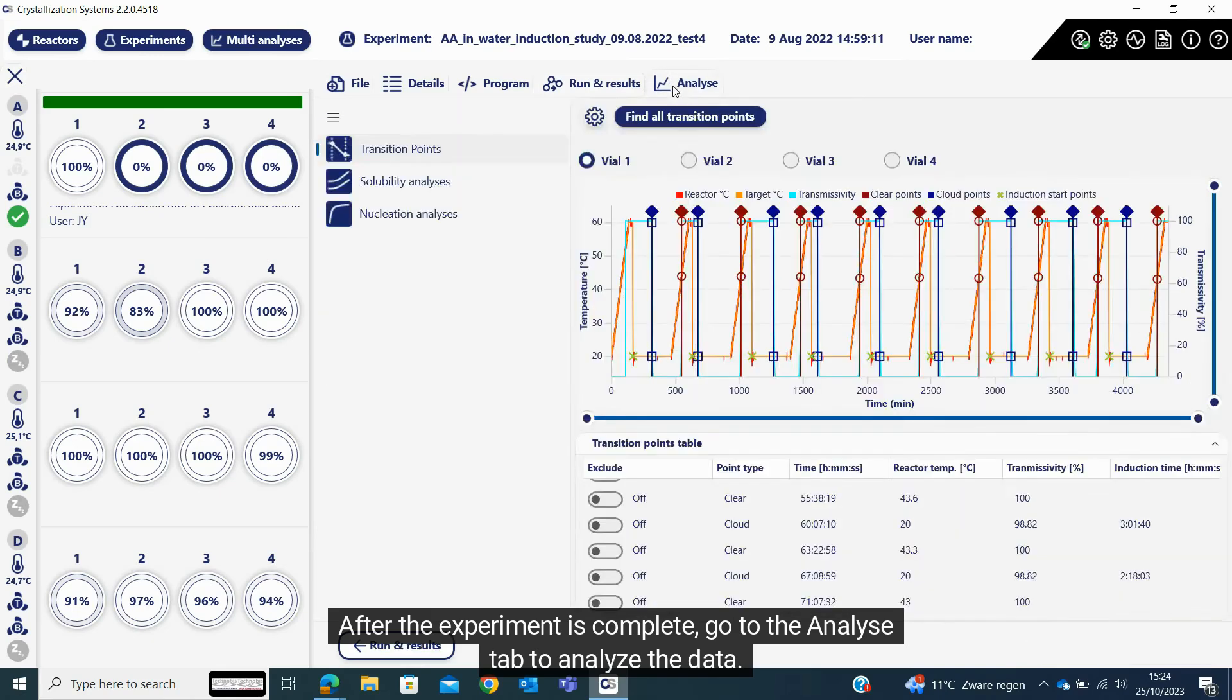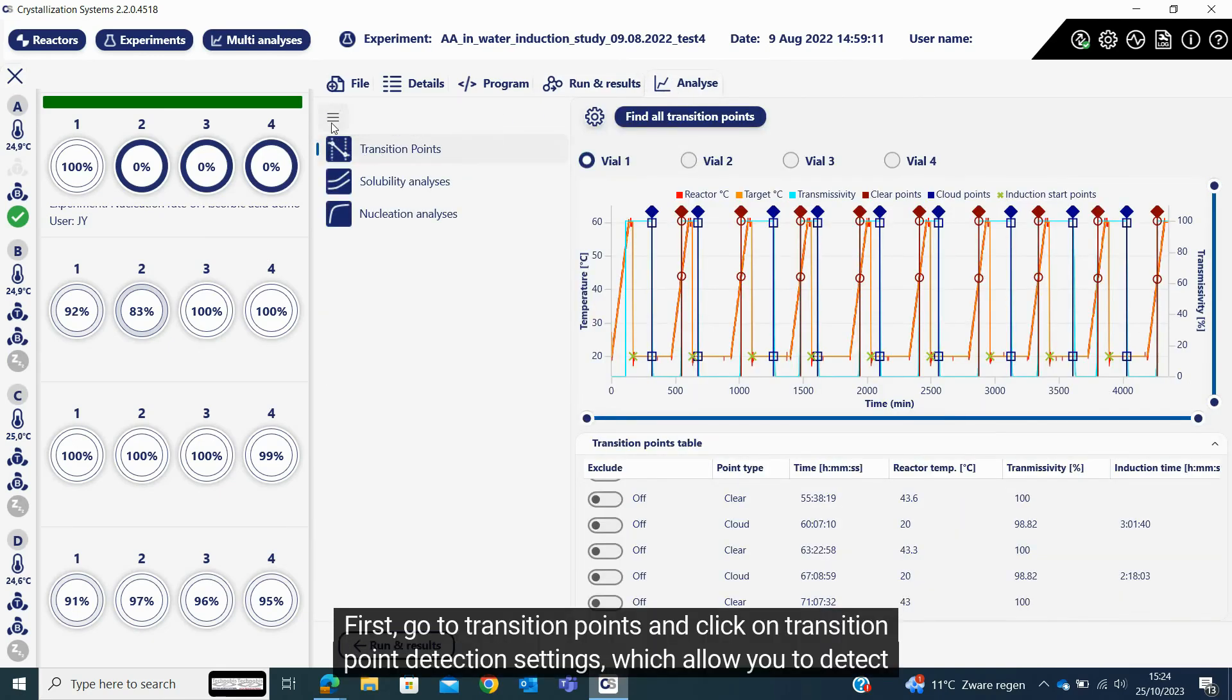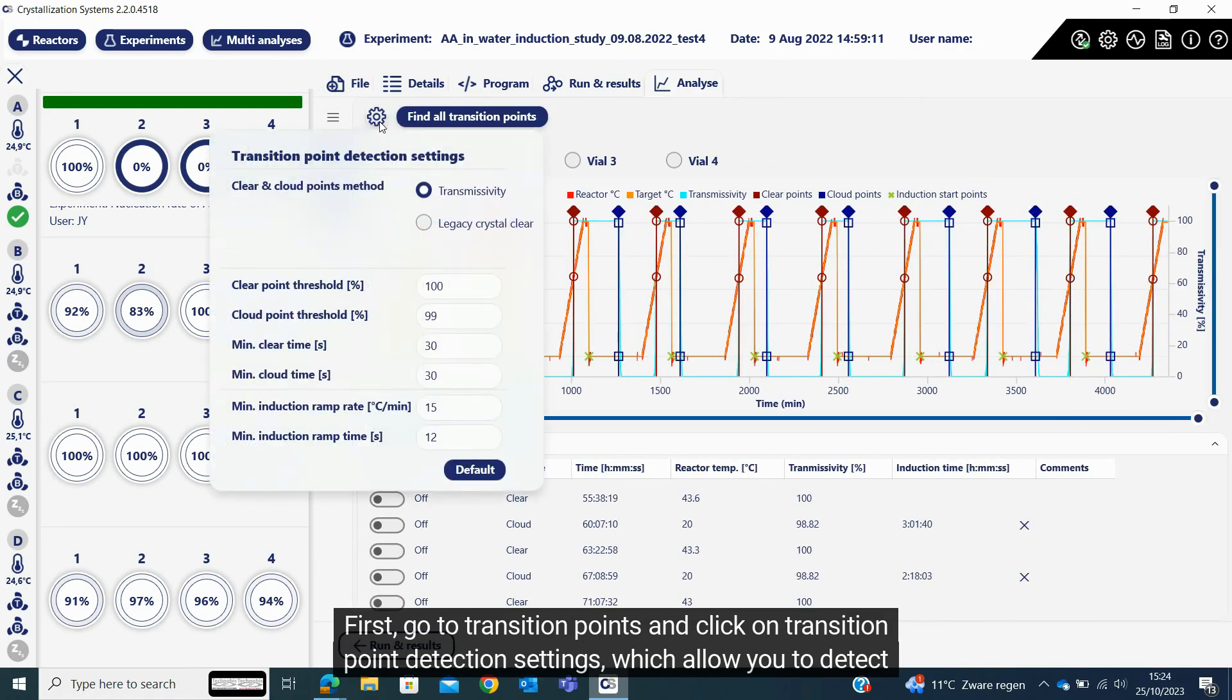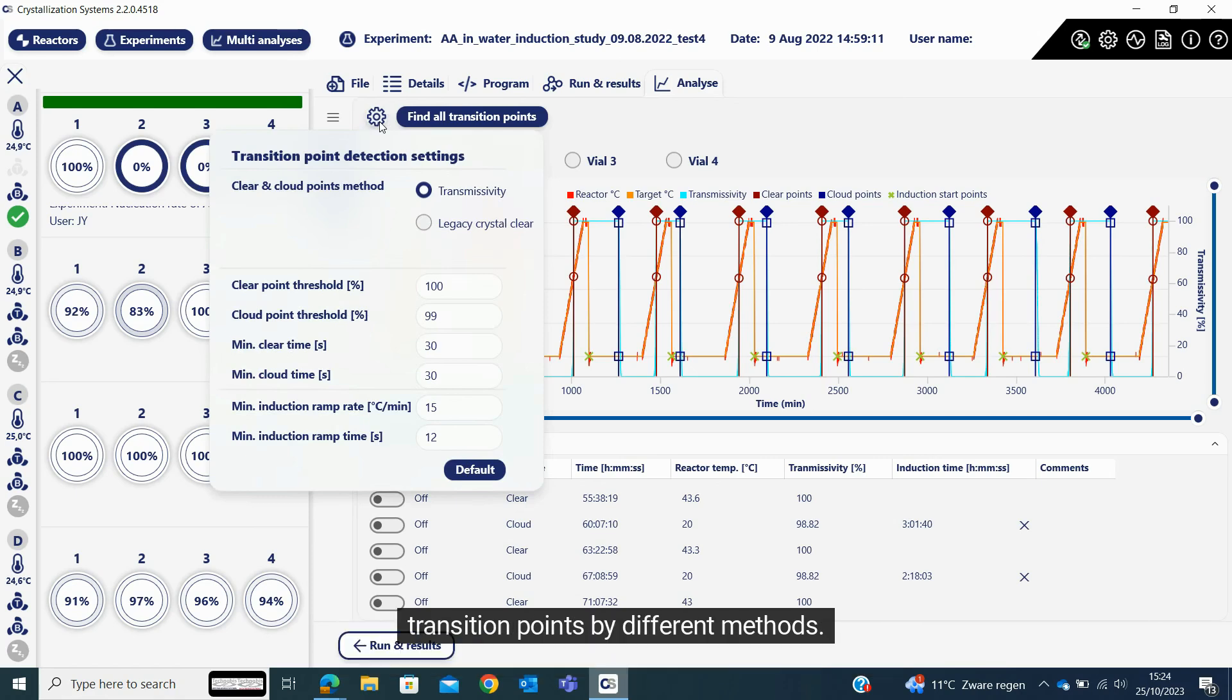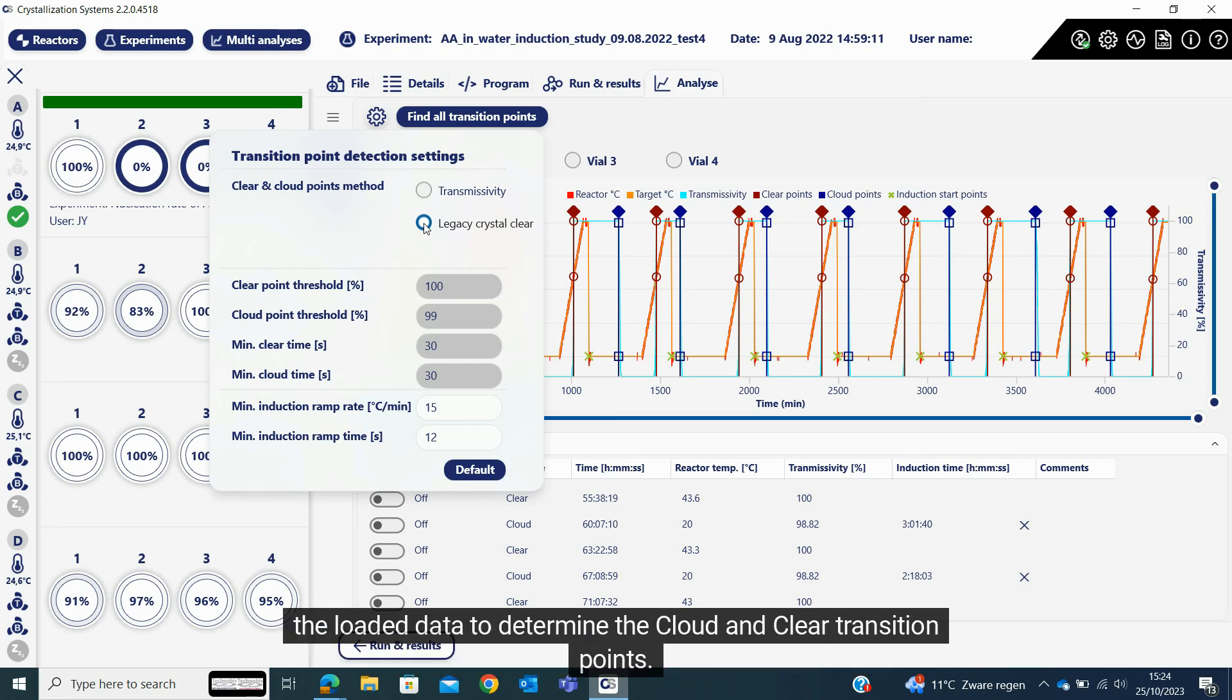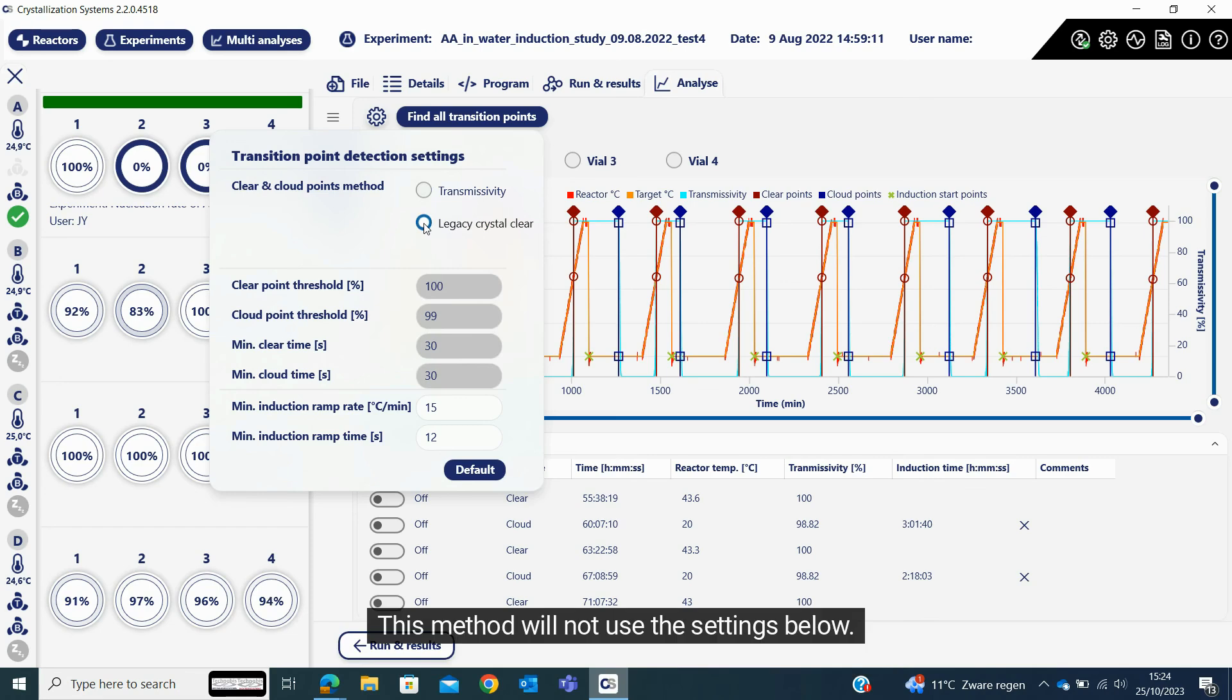After the experiment is complete, go to the analyze tab to analyze the data. First, go to transition points and click on transition point detection settings, which allow you to detect transition points by different methods. By selecting the legacy crystal clear method, the system immediately runs the built-in algorithm on the loaded data to determine the cloud and clear transition points. This method will not use the settings below.